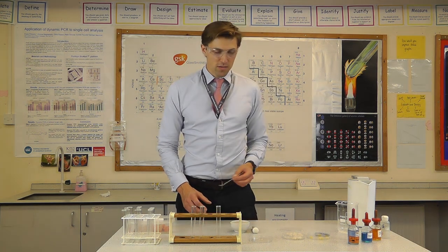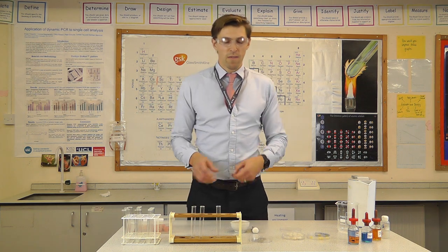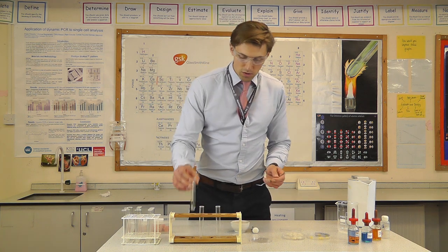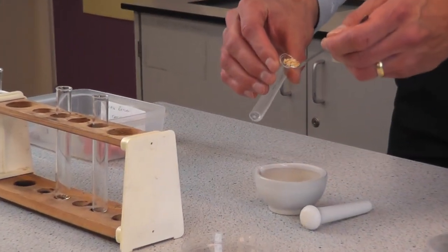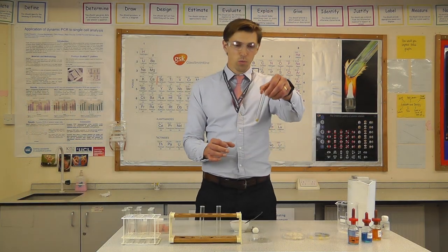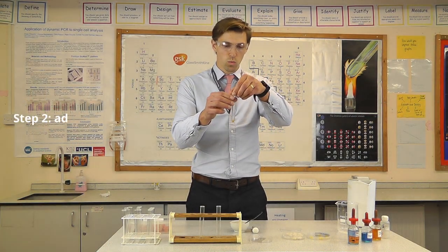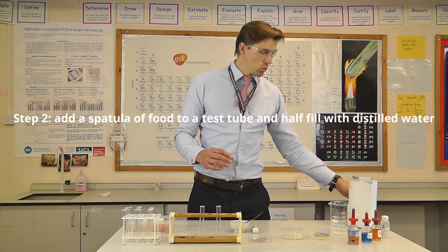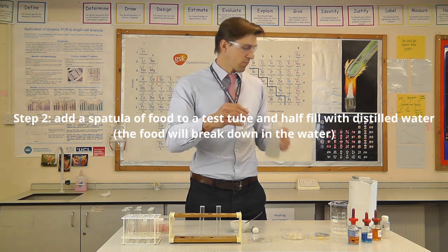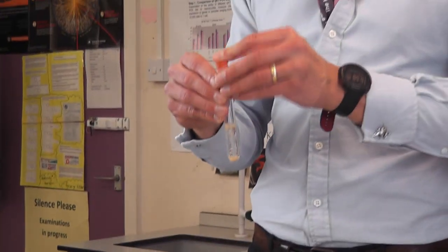I'm going to put a spatula of biscuit into a test tube — so I've got my biscuit, my bread, and my cheese. At this point I need to add some distilled water. Then I'll put a bung on it and give it a shake.